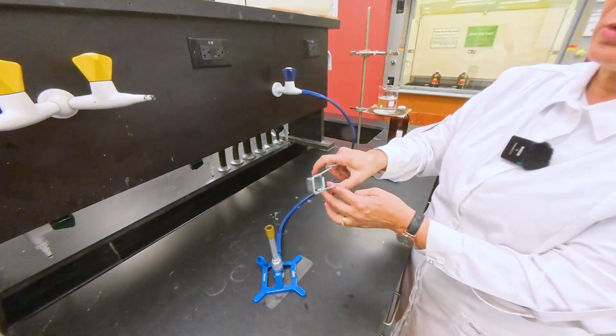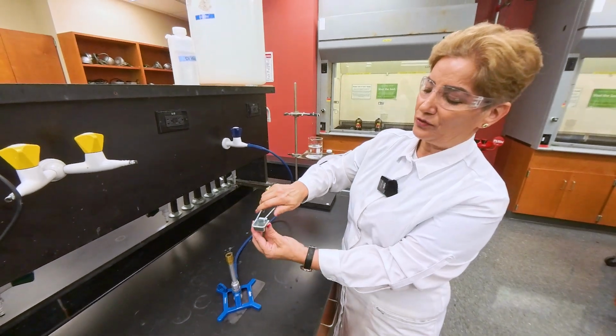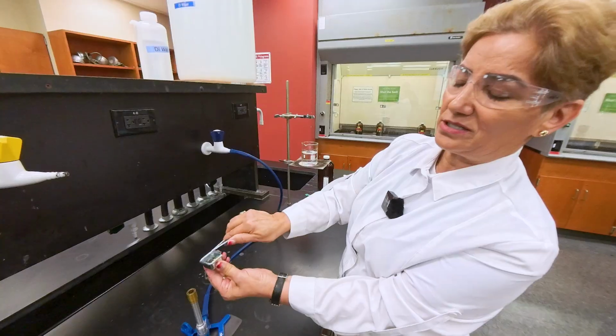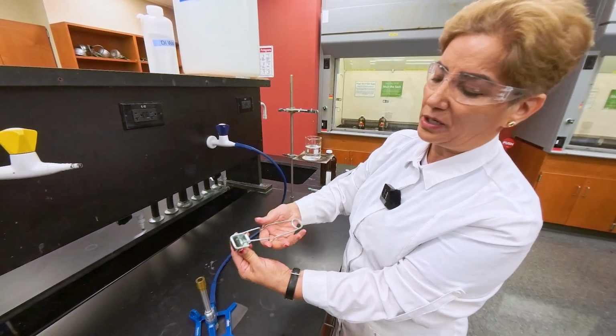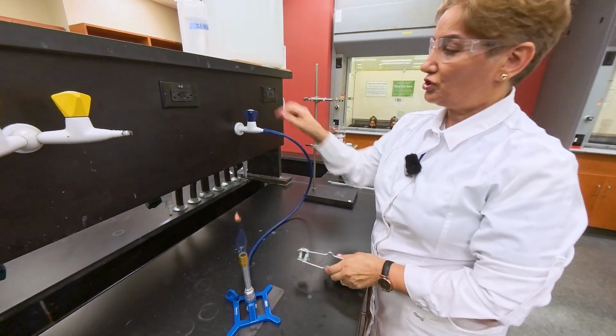Sometimes students, when they are striking, lift this up, and if you lift it up, even though you are sliding, it's not engaging and is not going to create a spark. So you need to know how to use this. Make sure you can generate the spark. Then you turn on the main gas valve and strike.